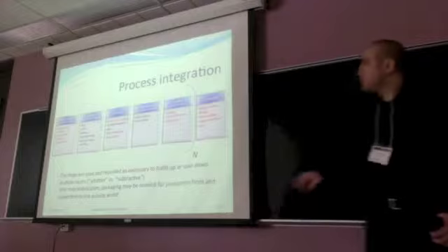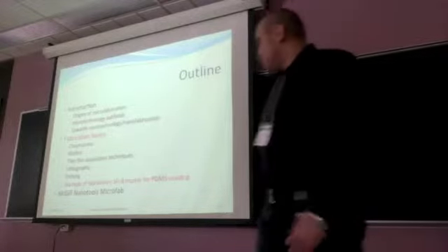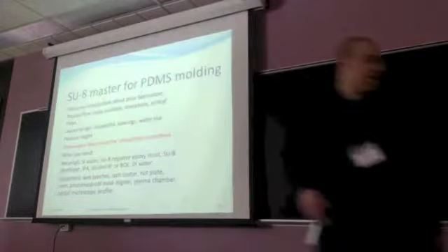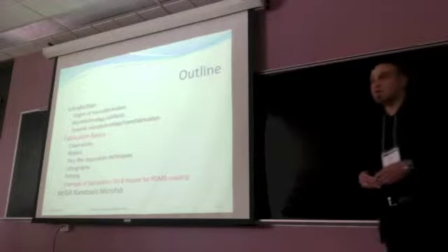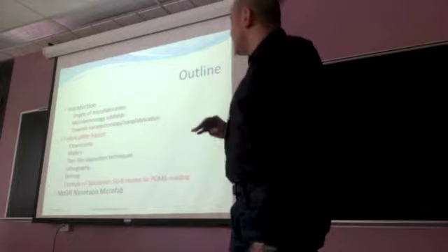So let's see now the example of SU8 master for PDMS molding. The SU8 resist has been specifically developed for applications where high aspect ratio structures are needed. And this is possible due to the low optical absorption of SU8.